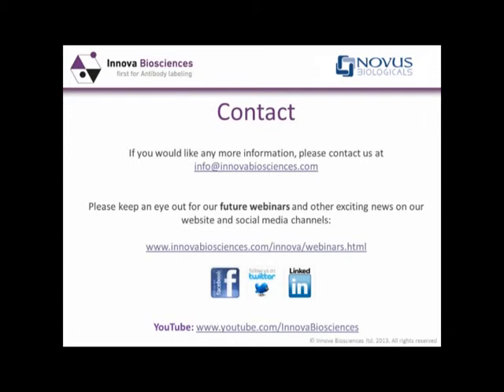Okay, the next question is, what does "none" at detergents mean? This is from the table. Let me just look at a paper copy in case that wasn't clear. Oh right, yeah, none is just no effect. So the substances in the table at those concentrations, there's no effect on the assay, so you'll just get the expected signal. No inhibition or any aggregation, anything like that.